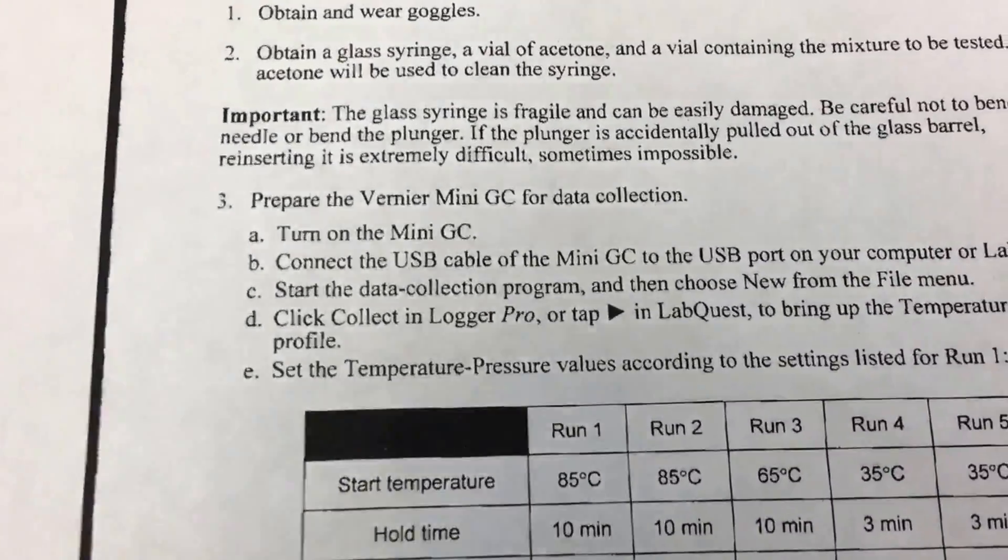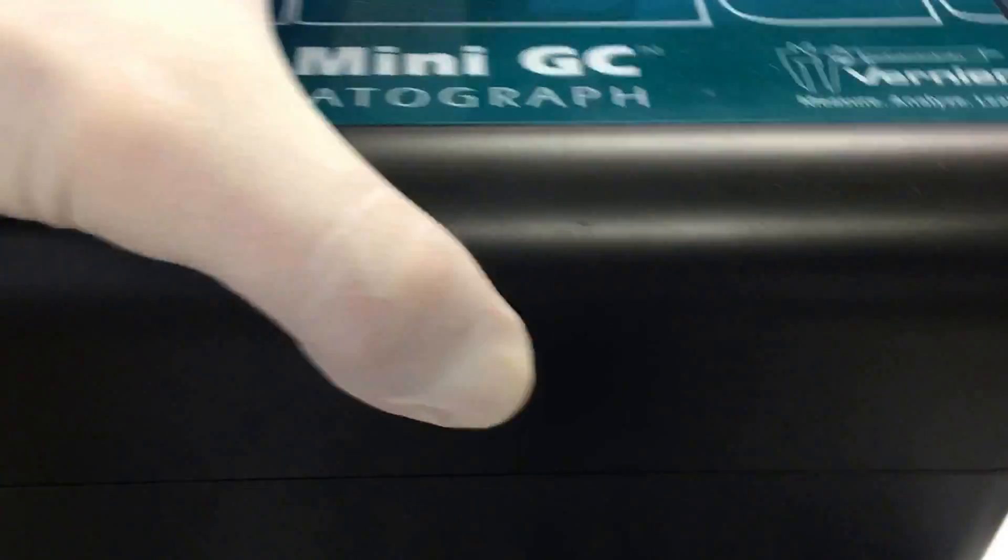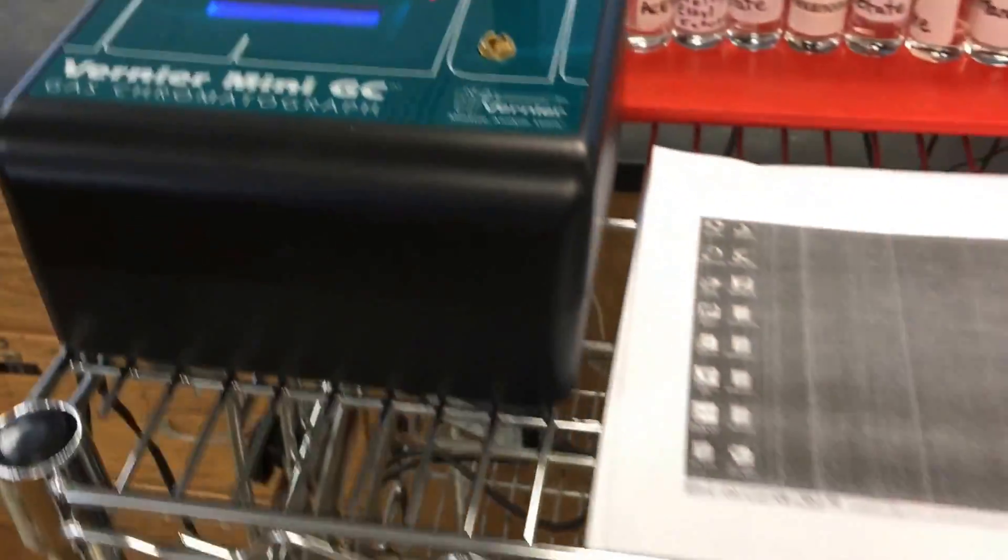To do this you need to hook up the unit — the green one right here. It's pretty small, light footprint, and practical and durable for students, but the grade is very good.